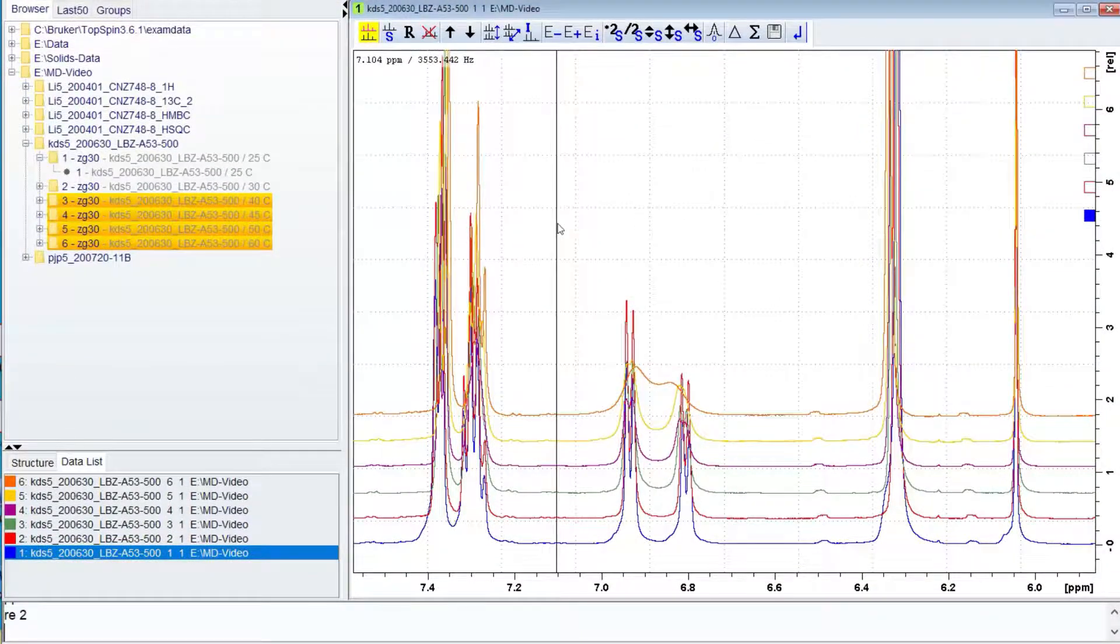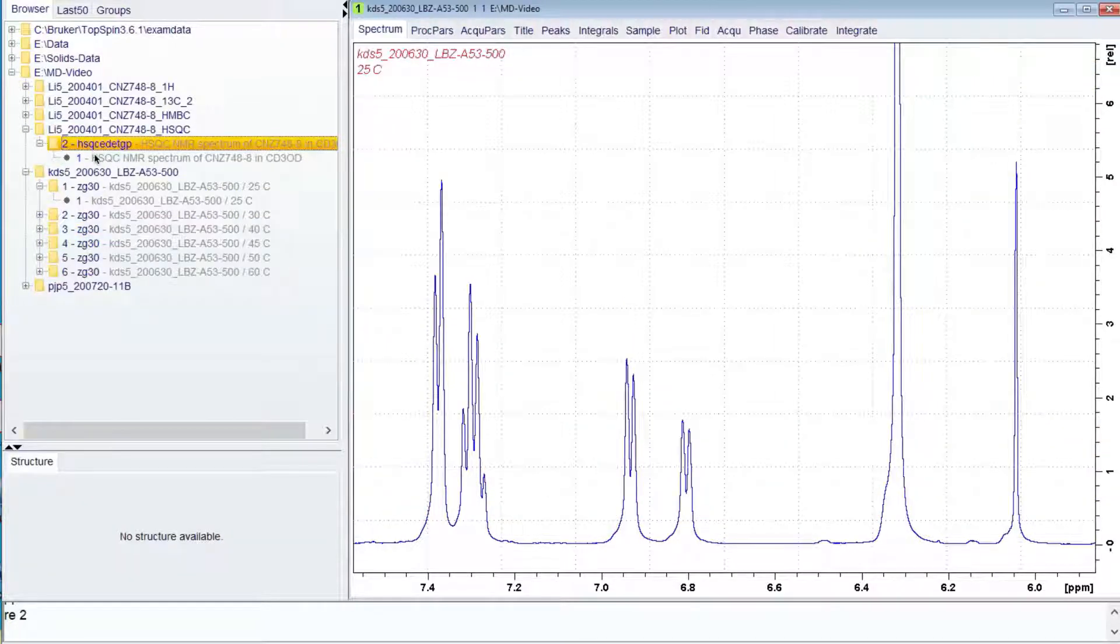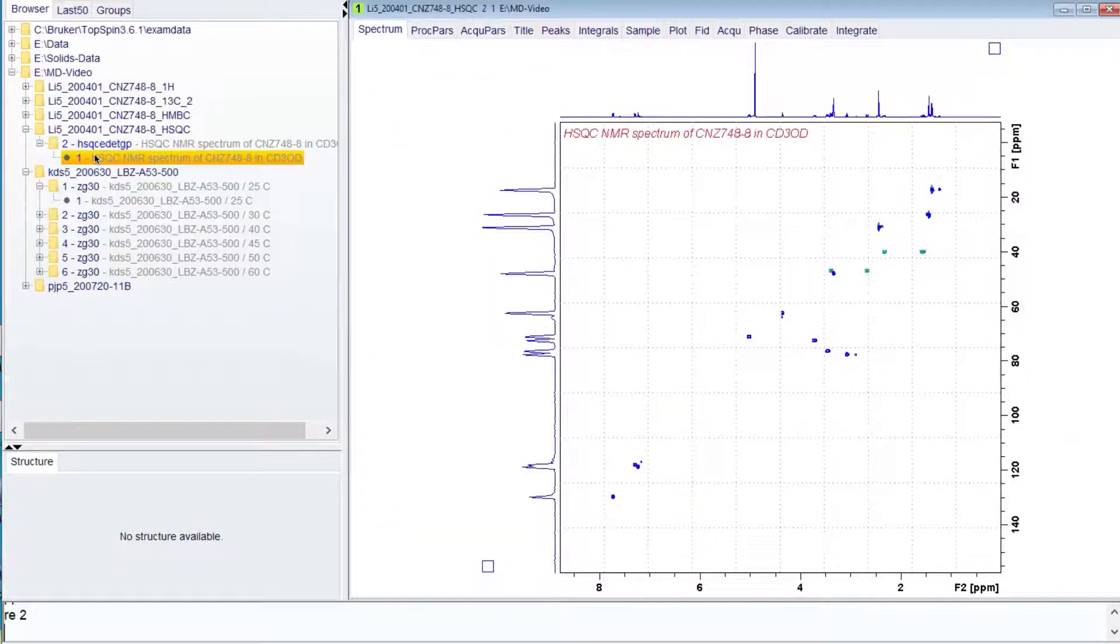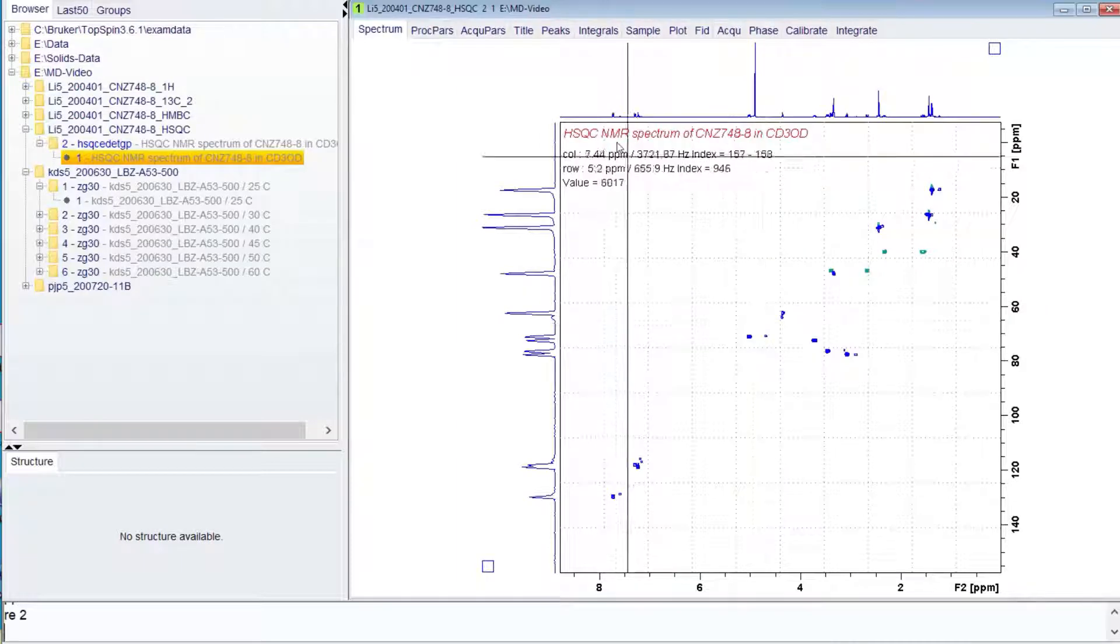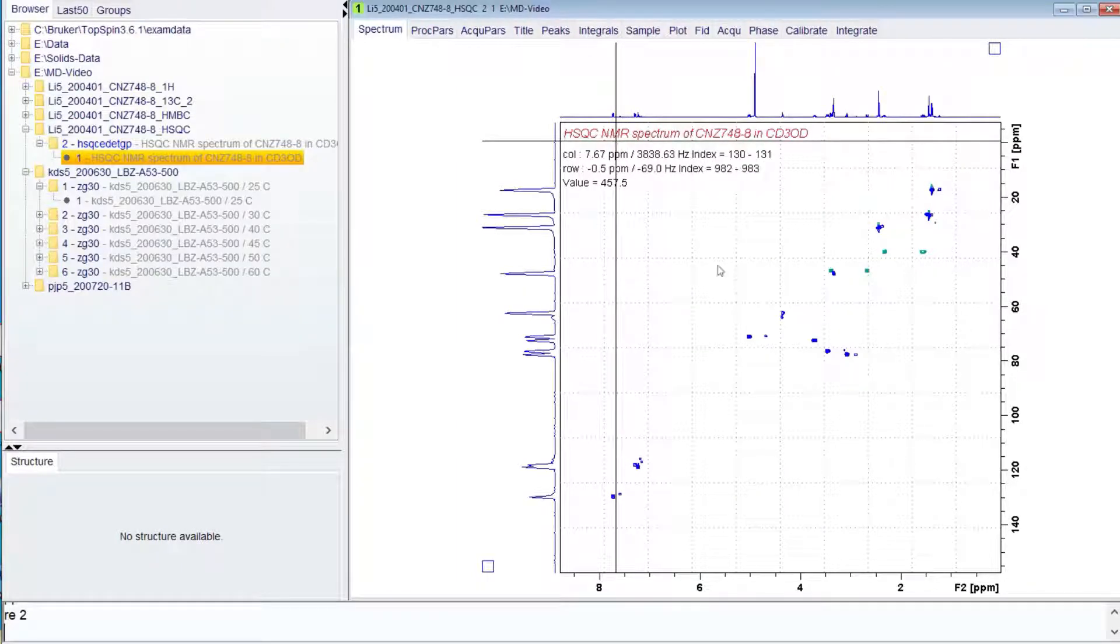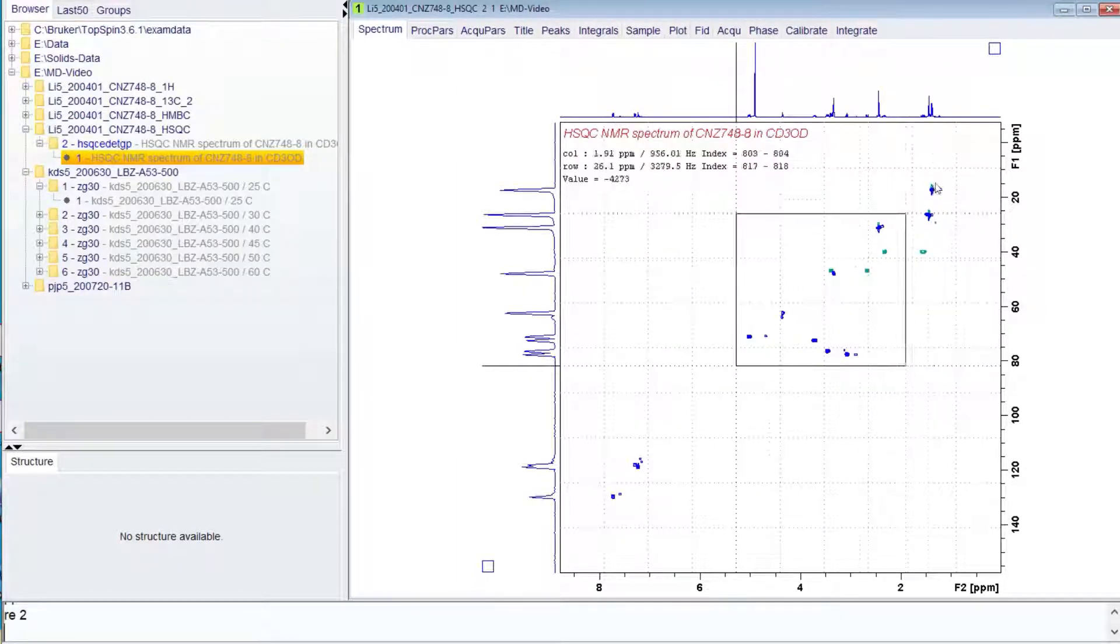Multi-display mode can be useful for two-dimensional results. Here is a HSQC spectrum. This experiment correlates protons to carbons that are bonded directly to each other.